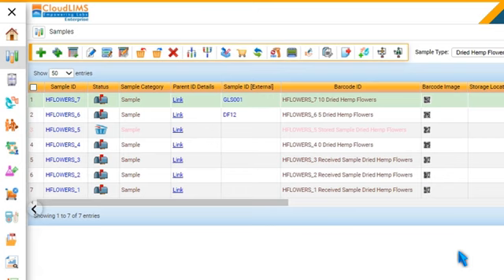Once a workflow is marked as complete or is terminated, it cannot be edited by any user unless unlocked. To unlock, select the sample and click Unlock Sample Process Workflow. You can now make the required changes to it.